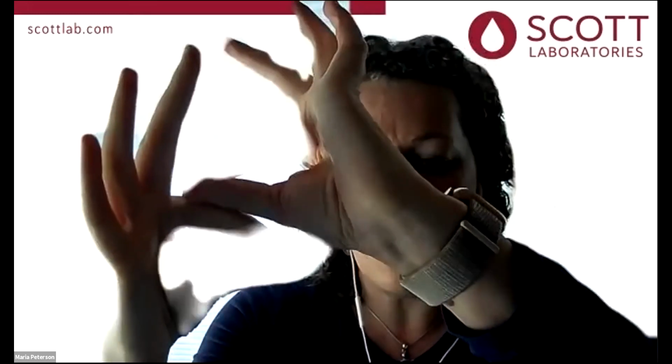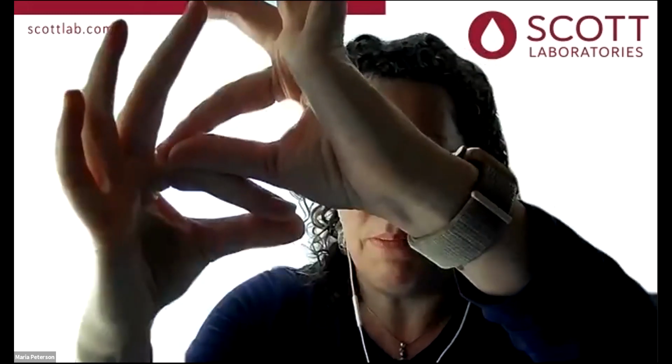So lenticular, if you think about a lentil, right, the lovely pulse that we don't eat enough of, which is so healthy, that kind of looks like a football, right? So like that. And if you think about that, there's another one on top of it. My camera is a bit funky, but they're kind of like on top of each other, right? That's where the name comes from in a lenticular filter. There are these cells of filter sheets on top of each other. And if you look at it, it just looks like little lentils stacked on top of each other. That's literally where the name comes from.